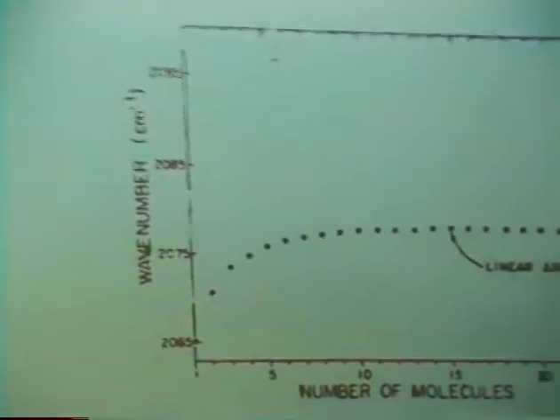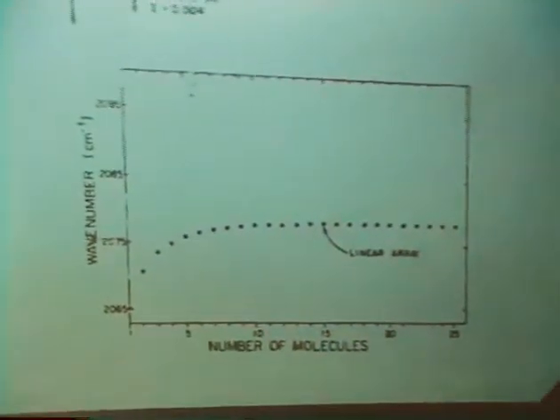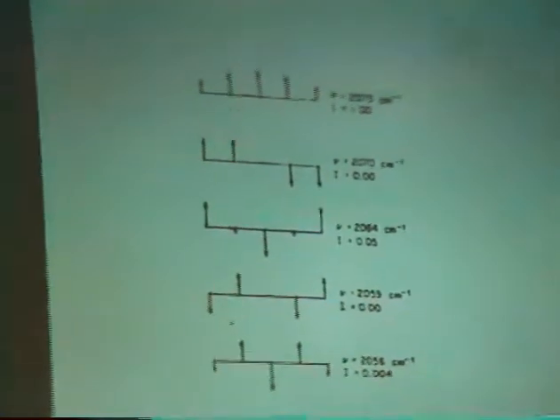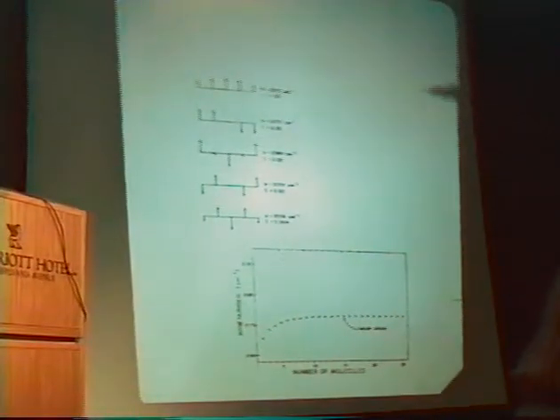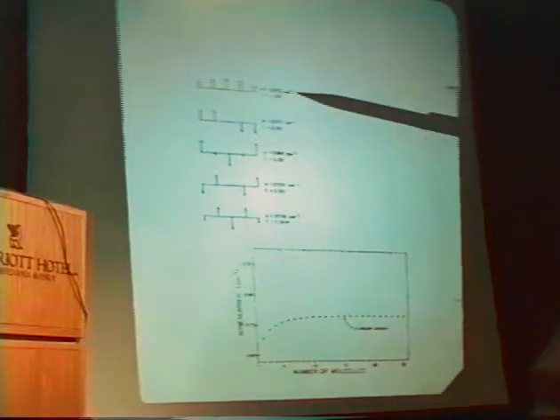And you see there are 5 normal vibrations, 5 normal modes, and we've plotted them out here, and the length of the arrow represents the magnitude of the motion of that oscillator. So there's a couple things to see here. This highest frequency mode has everything oscillating in phase.